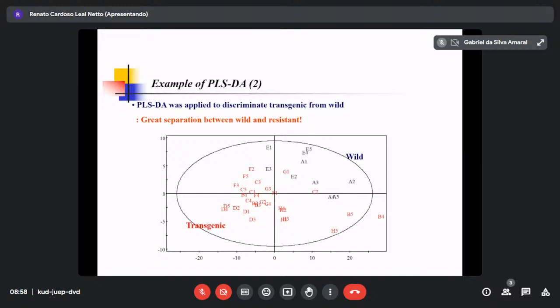You understand? Yeah? Of course, usually in principal component analysis, data reduction, you don't need it, or I even delete this, right? But as I told you, there are no perfect rules. Always, if something is there, you can trust it.